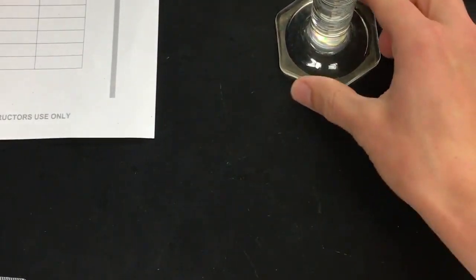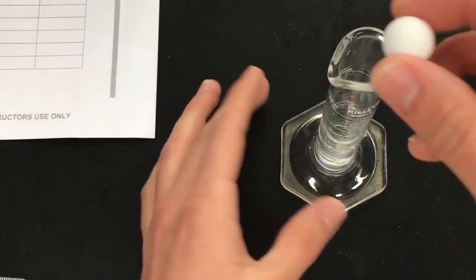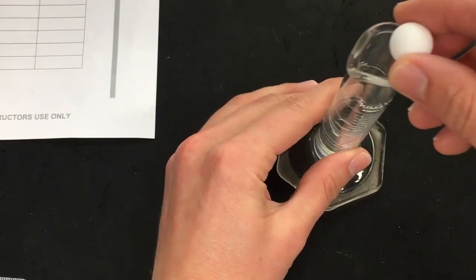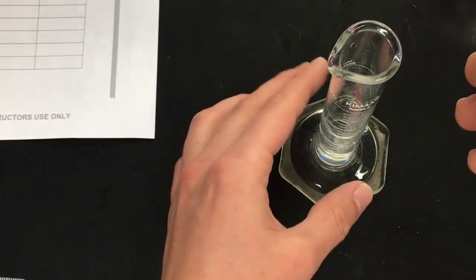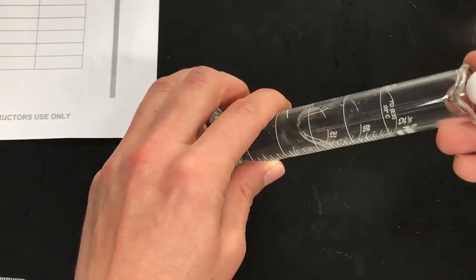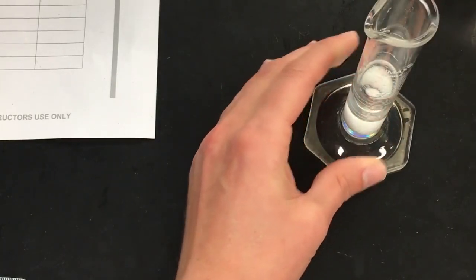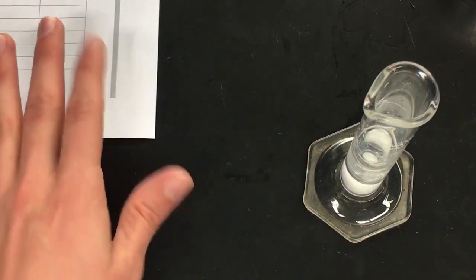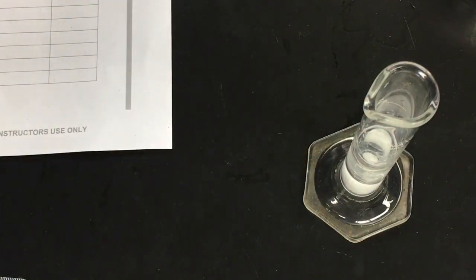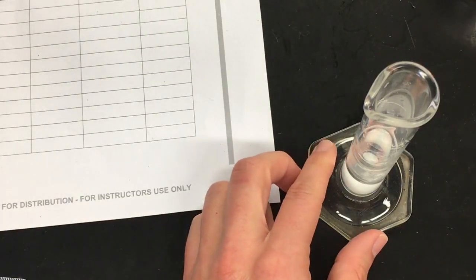Now, I'm going to put the Teflon ball in there and it's going to displace a certain amount of water, and the water level is going to rise and I'll have a new measurement. The better thing to do is to not splash this water because I don't want to lose any from the vessel. I want to maintain everything that's in there because it's only going to make my measurements better. So I'm going to slowly tip this, let it roll in. I don't think I lost too much. Okay, well, the Teflon ball went to the bottom, so that should tell us it's denser than water. And water has a density of about 1 gram per centimeter cubed. So I'm going to take my next measurement.